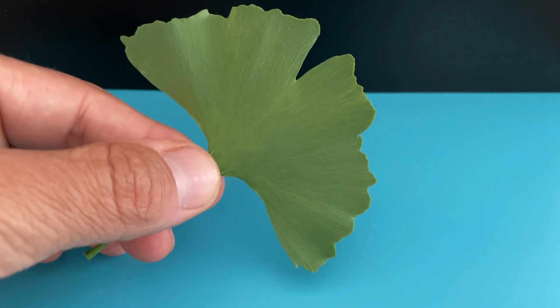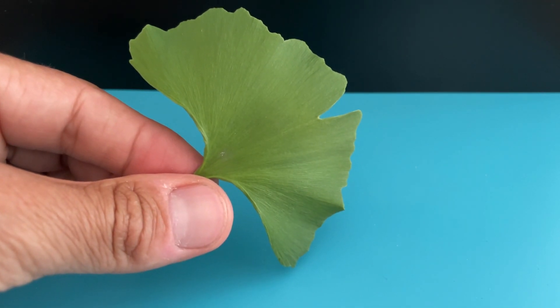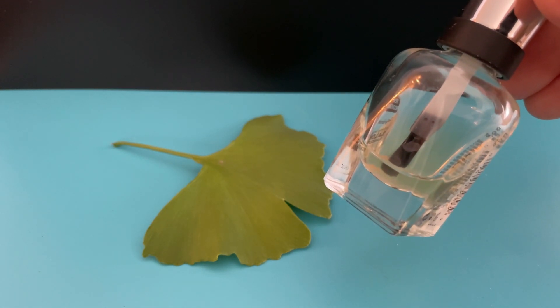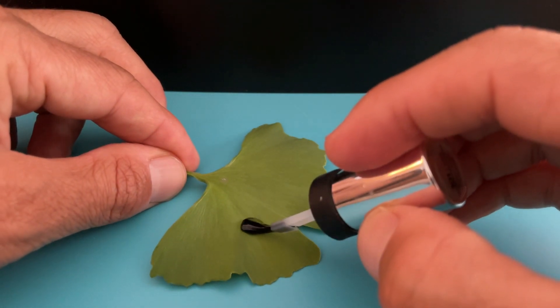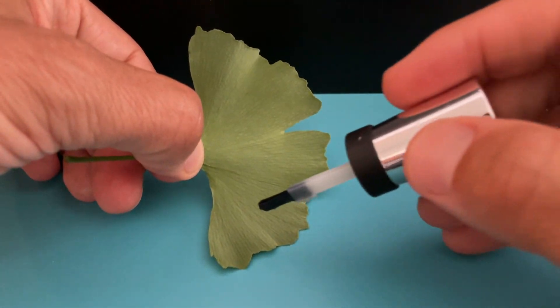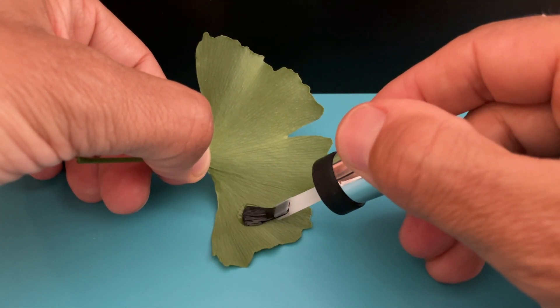I am going to look at this ginkgo leaf under the microscope, but I am going to look at it in a very special way. This right here is clear nail polish. I am going to apply it to the leaf — I am applying it to both sides of the leaf because each side of the leaf looks different.